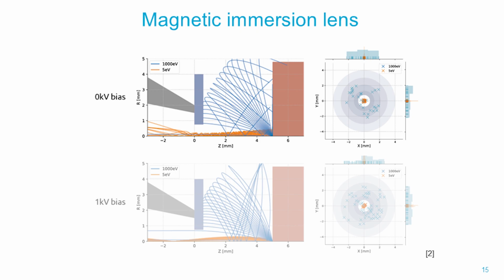You can also see that where we have the position of the backscatter detector, the immersion field in this simulation stops, and there the electrons again go in straight lines. So also we see the backscatters are deflected, and in this case with a quite high working distance, this means that several of the backscatters are actually reverted back and may hit the sample again. So you also see this in the cross section. The secondary electrons now don't hit the detector anymore. They're actually even more narrowly focused to the optical axis than in the case of only the electrostatic immersion field, but also not so many backscatters hit the detector anymore.